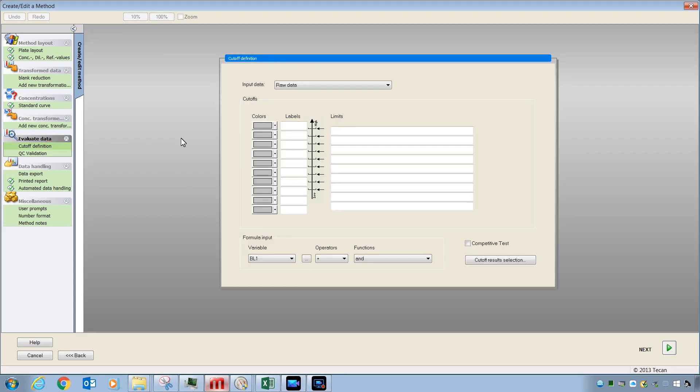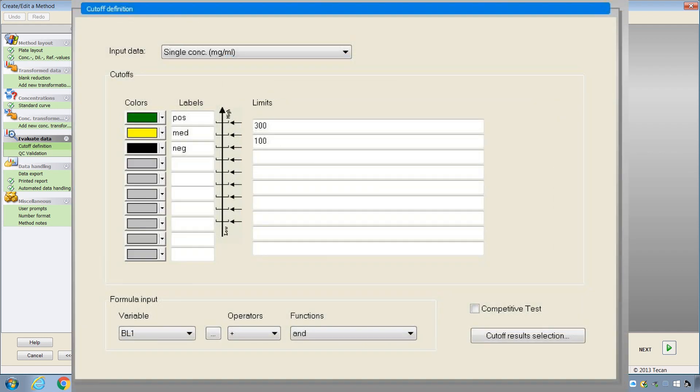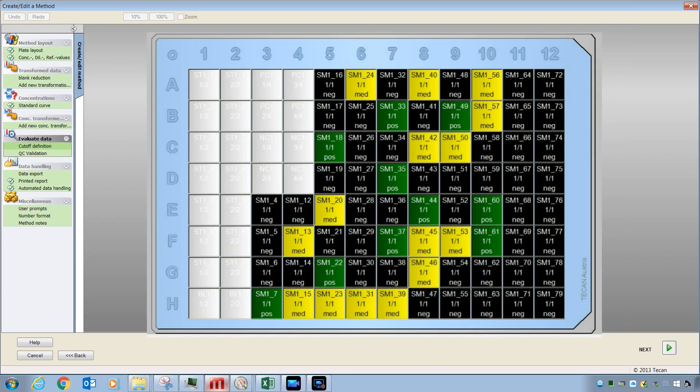The Cut-Off Definition is a feature that allows you to create your own custom scale and analyze the data on your plate based on that scale. Here is an example of how that might be set up. And here is an example of what the results would look like. You will also get some statistical values for how many samples were positive or medium or negative.